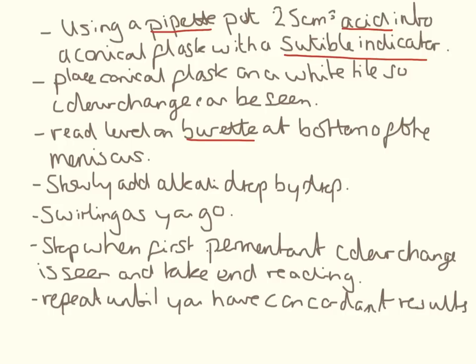Slowly add the alkali or the acid, drop by drop, swirling as you go. Stop when the first permanent colour change is seen. This is really important, and take a reading. Repeat until we have concordant results. Concordance is just a fancy word for saying the same results.